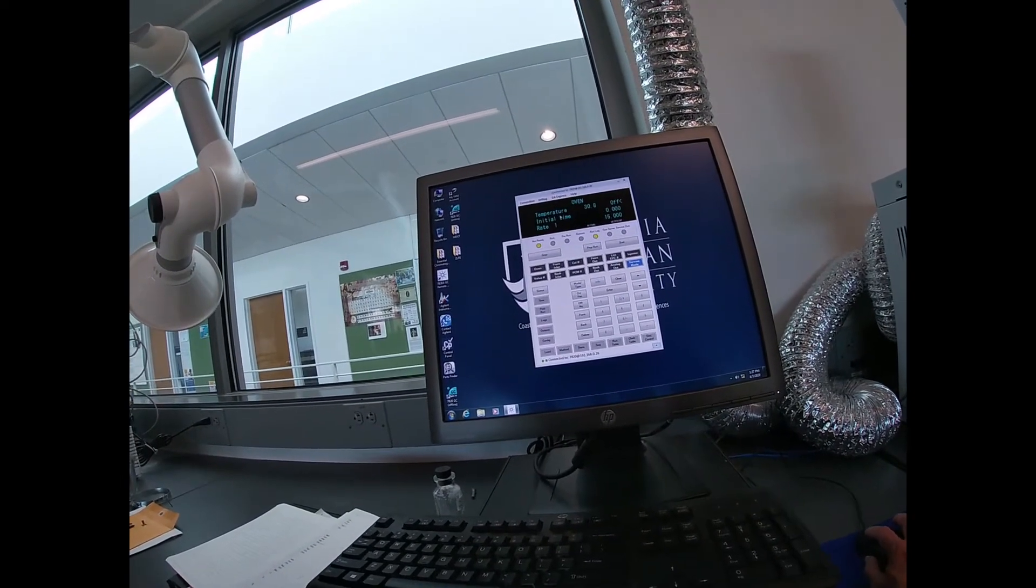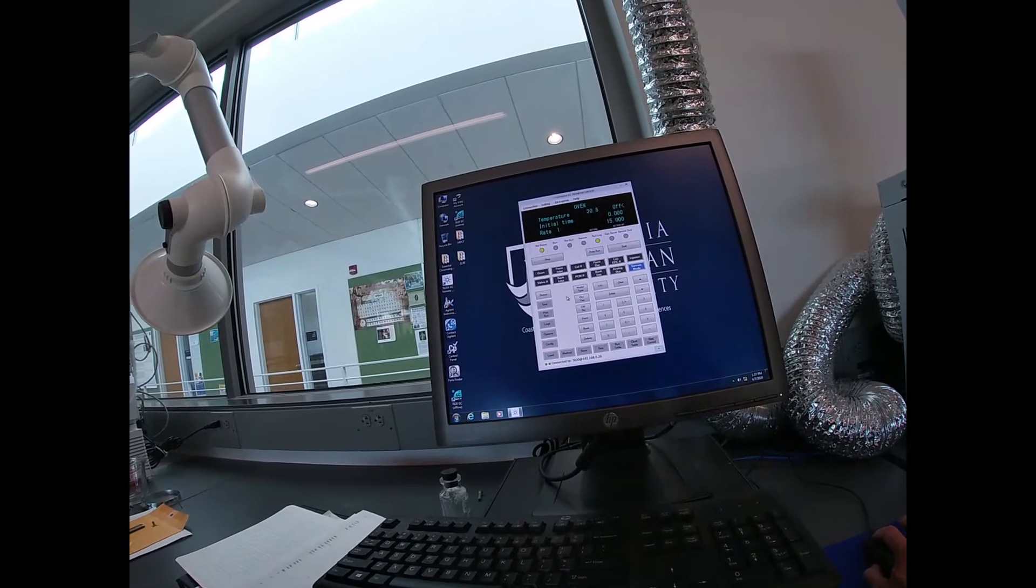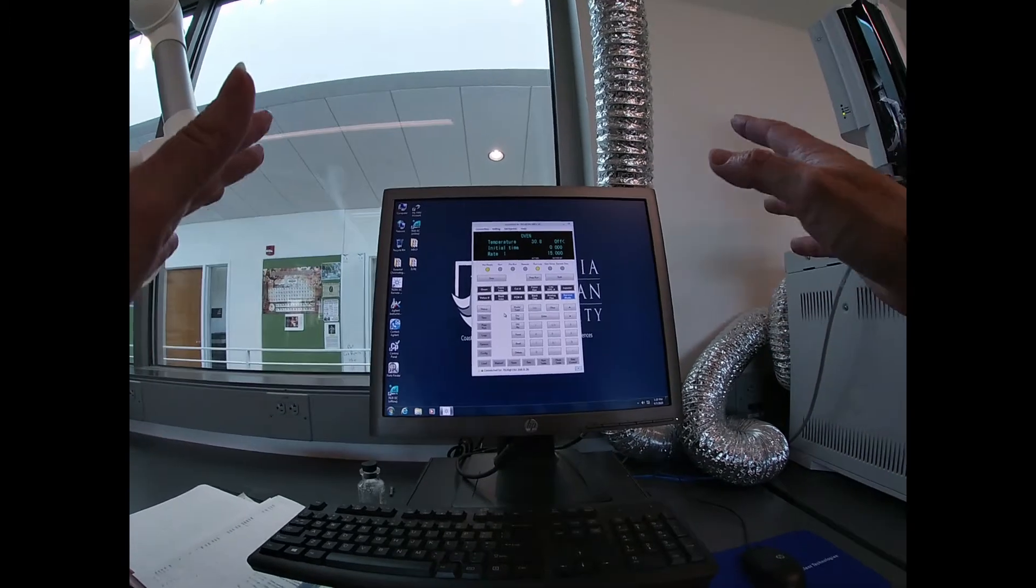So this one is actually controlled via a keypad that is electronic. So again, we control temperature, flow, pressure of our gases. Just to give you an idea of the controls we have.